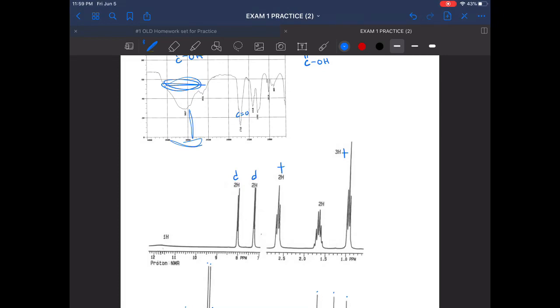You will notice something here that maybe you didn't notice in the really pretty NMRs from the lecture. Sometimes your signals lean. So the triplet isn't perfectly 1 to 2 to 1. One side's a little bit taller than the other. That's actually pretty common. A lot of times signals will lean a little bit like this, and it's nothing to be alarmed about. Here, I would say this one's a little bit trickier. You could initially look at it and want to call it a sextet, but anything above a quartet, a lot of times I call a multiplet until I have more information, because you can start to see whatever little peaks out here start to get lost.